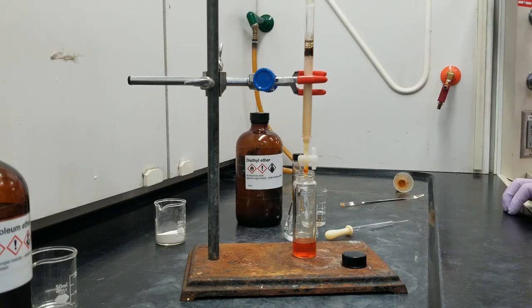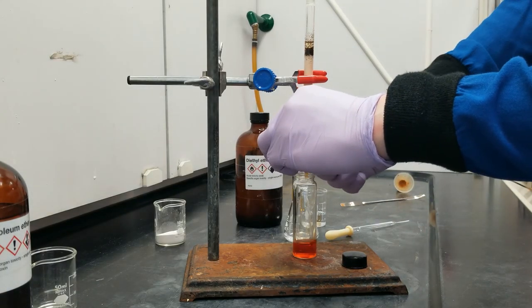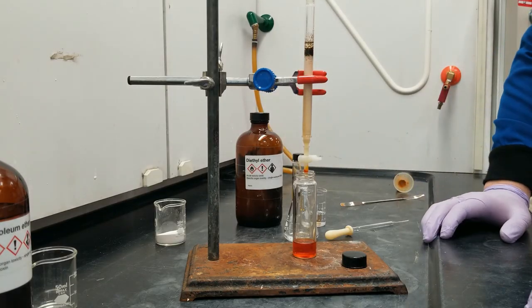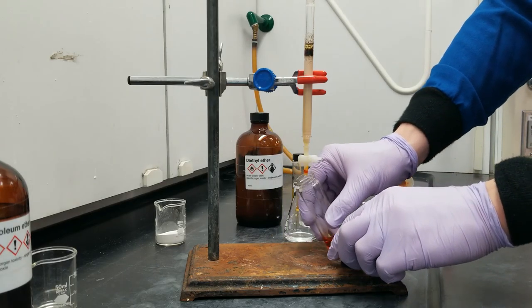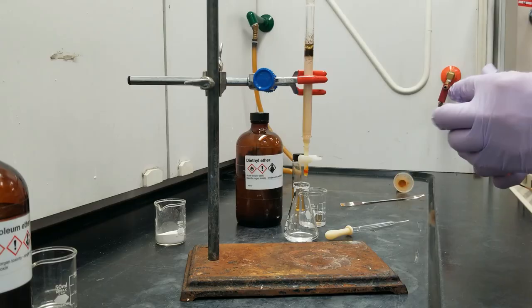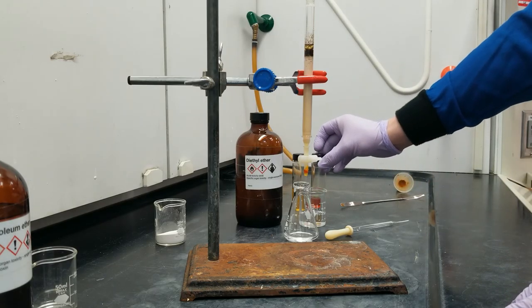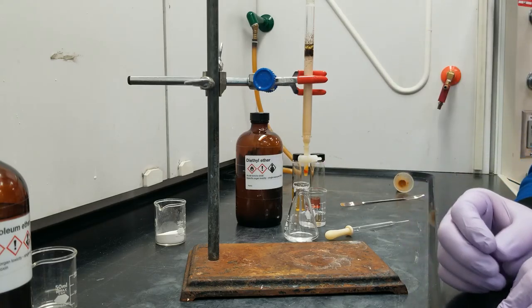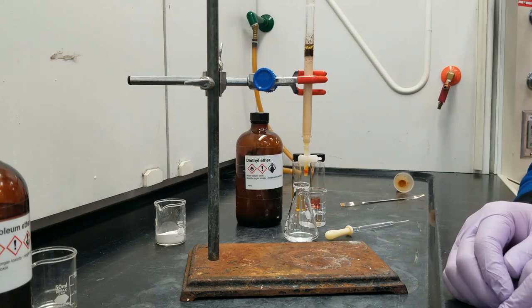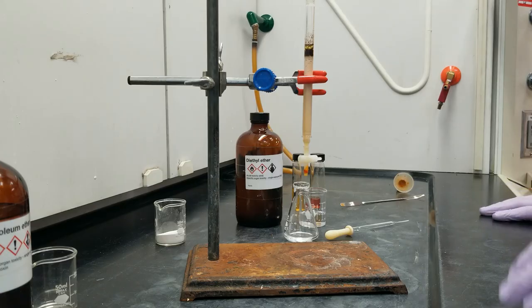Okay, I feel comfortable stopping now. The drops coming out of the column at this time are almost completely clear. So I've collected nearly all the acetyl ferrocene that I can. Now, with the sped up time, from the time that I wetted down the column, this has been going for about 45 minutes. Just to give you guys a reference of how long that took.